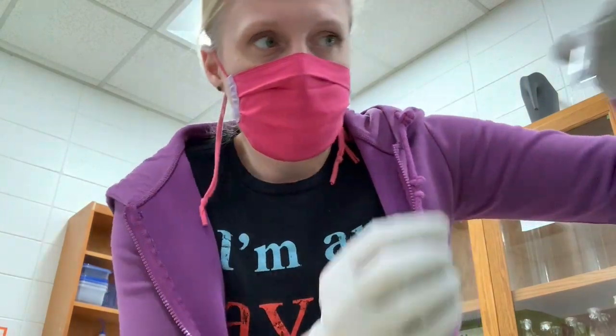If you think you need to move them back to your rack to be able to pipette more easily, that's fine too. But I'm going to, after this spin is done, add 200 microliters more of DNA wash buffer, and then do another spin just the same as the ones I've been doing. So at the end of the second spin, my samples will have a total of 400 microliters of wash buffer in the collection tube. I'm going to take these tubes and discard the supernatant in the sink.